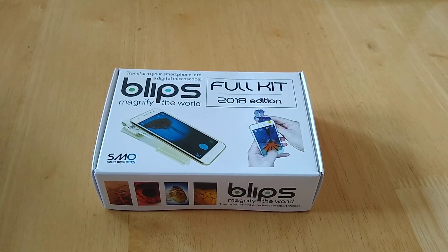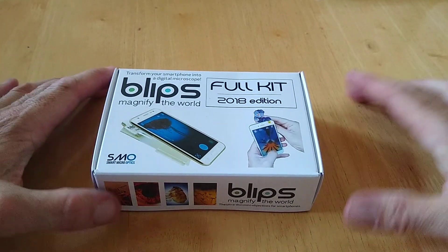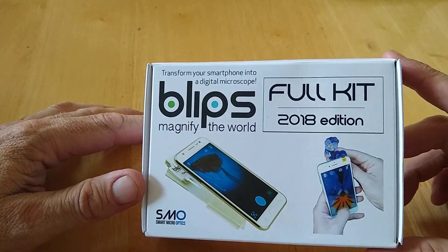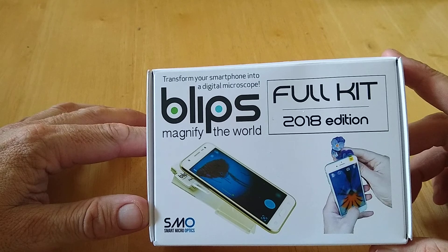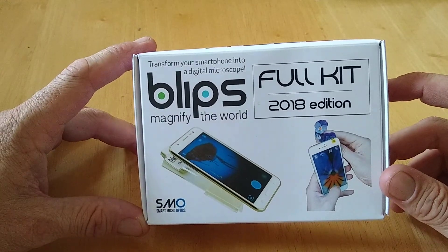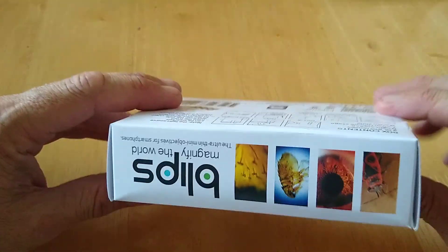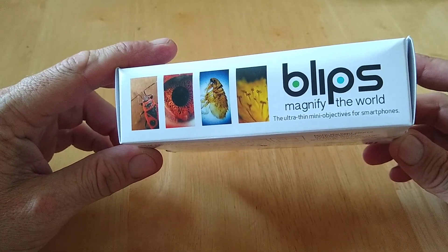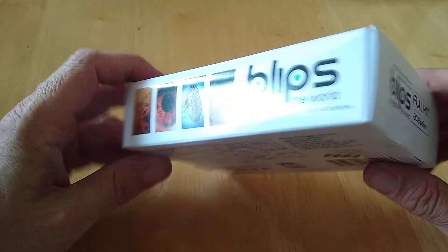Hello, this is Jim from Tech Bros, and today I'm going to give you a quick unboxing of this new tech product called Blips: Magnify the World. This is a full kit, 2018 edition, from Smart Micro Optics. Basically, it transforms your smartphone into a digital microscope. The magnify-the-world ultra-thin objectives for smartphones.